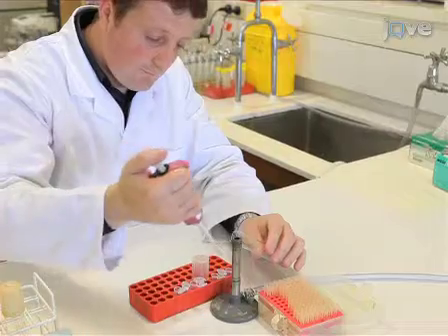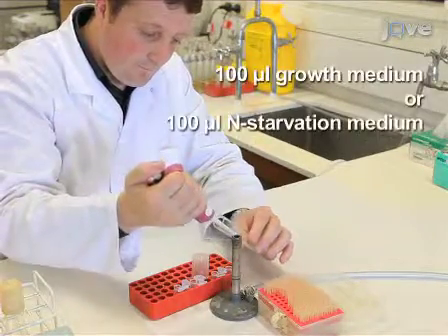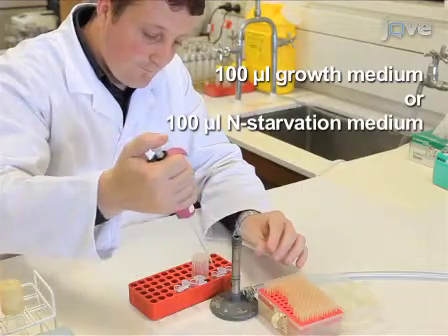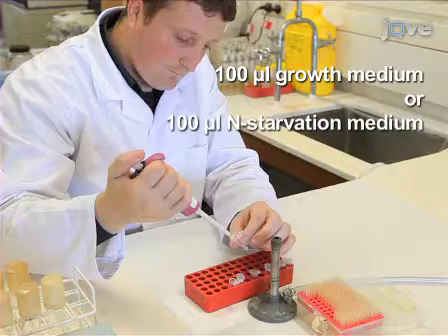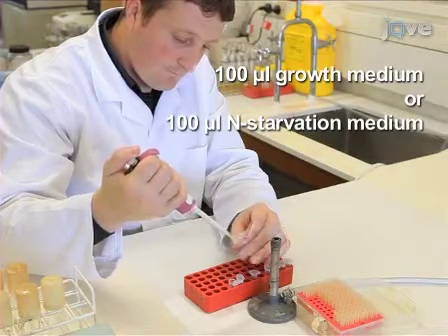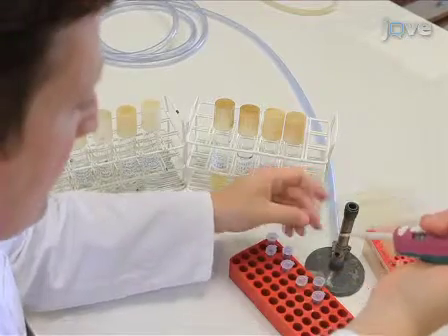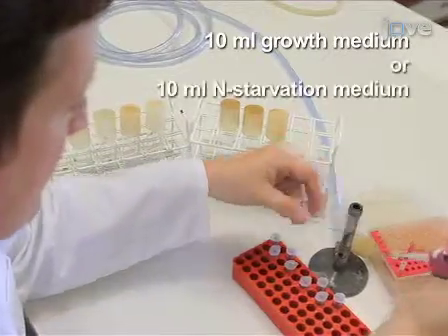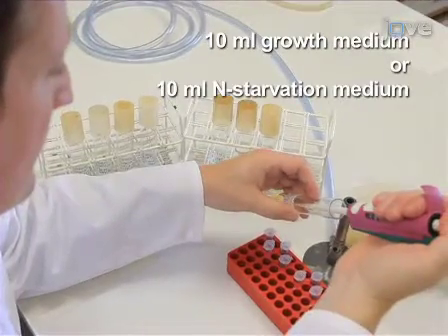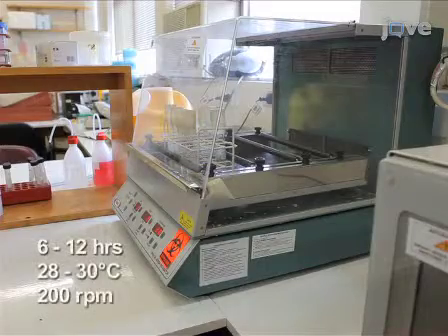After the third wash, resuspend the cells in either 100 microliters of growth medium or nitrogen starvation medium. Nitrogen starvation medium contains the carbon source ethanol but lacks nitrogen supplements and will induce mitophagy in cells. Next, re-inoculate the resuspended cells into 10 milliliters of fresh growth medium or 10 milliliters of nitrogen starvation medium. Incubate the cultures with orbital shaking for 6 to 12 hours.